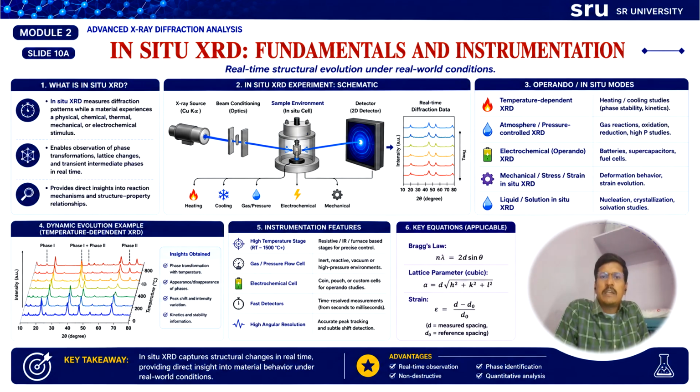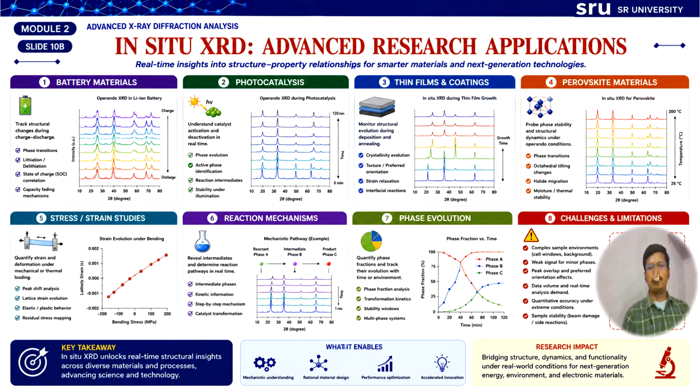Finally, you can say one thing: the in situ XRD enables real-time monitoring of structural evolution, allowing researchers to study materials under realistic operational conditions. Now let us discuss the important and advanced research applications of this in situ XRD facility.